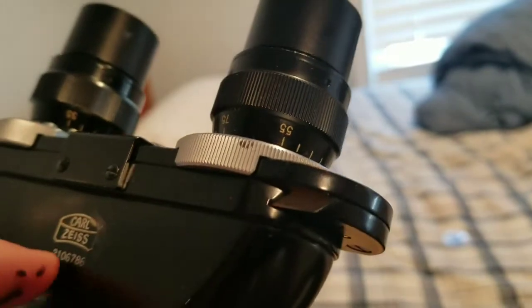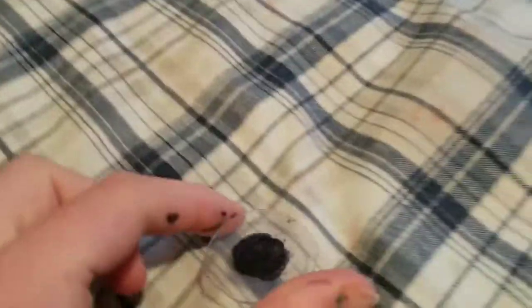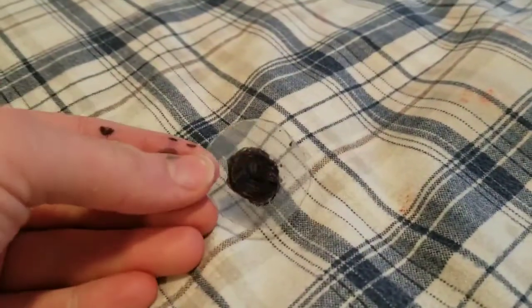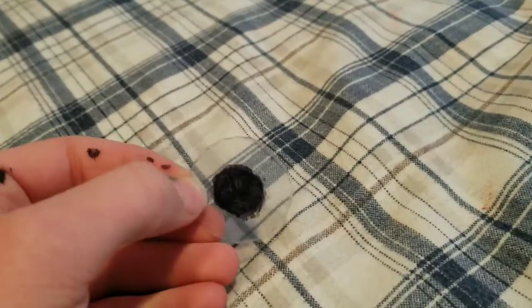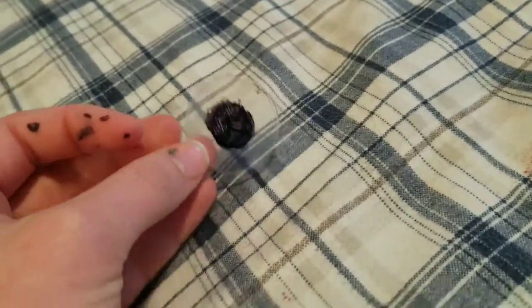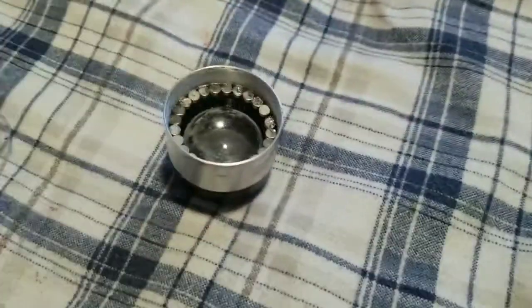As you can see, I repainted it to match the head of the microscope. I didn't want to paint over the head because it's a Carl Zeiss model, and Carl Zeiss makes really good microscopes, and it looks cool. But anyway, to convert my polarized light microscope into a dark field one is pretty simple. I just made these little filters by cutting out some plastic gum container and adding some Sharpie circles in the middle. Then you remove the condenser and you stick some magnets in there to hold it in.